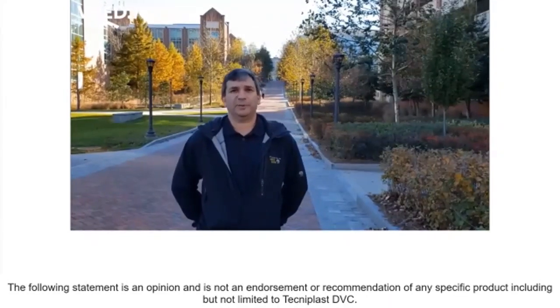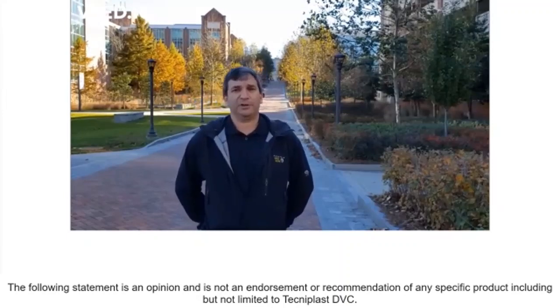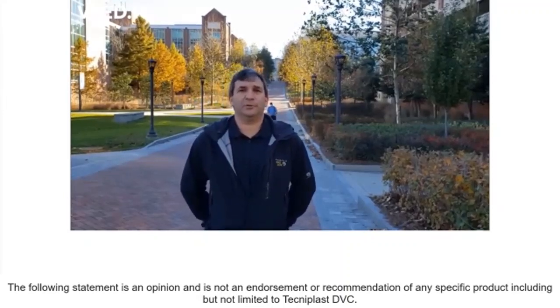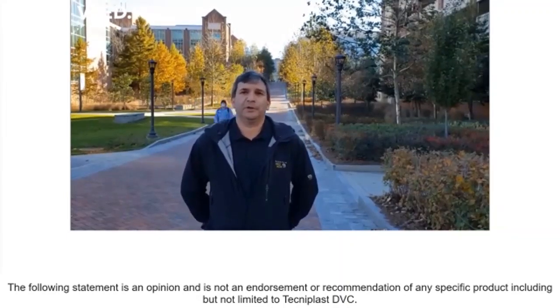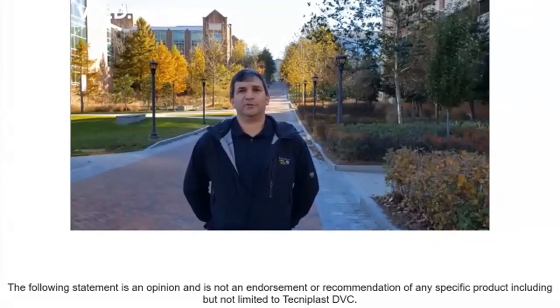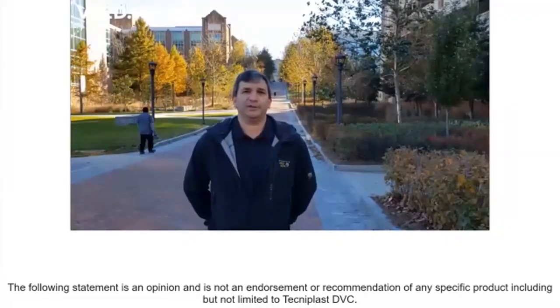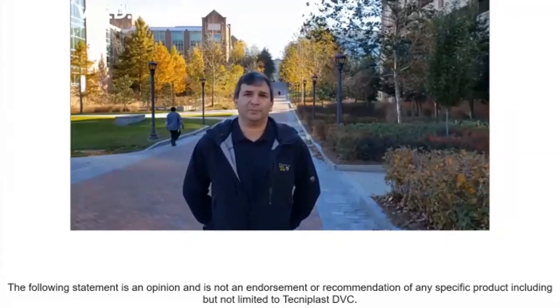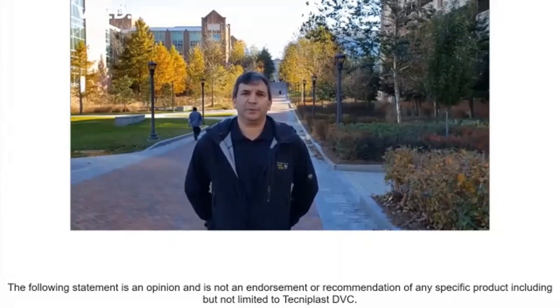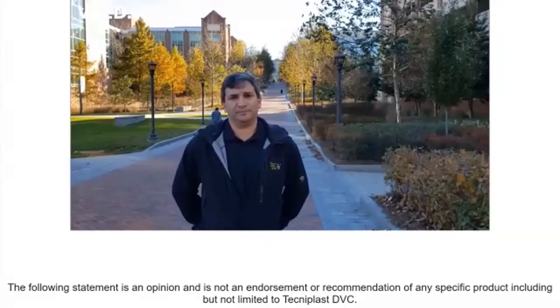Secondary to these attributes, there's a possibility for significant cost savings in terms of cage changes and personnel effort, as well as intrinsic inventory and cage space use measurements. You can imagine an extension of this data whereby a manager could deploy personnel in a much more efficient and effective manner based on feedback from the system in terms of how dirty a cage is, and what level of animal activity is measured in each cage. This in turn could be linked directly to a more focused health check and better case management.